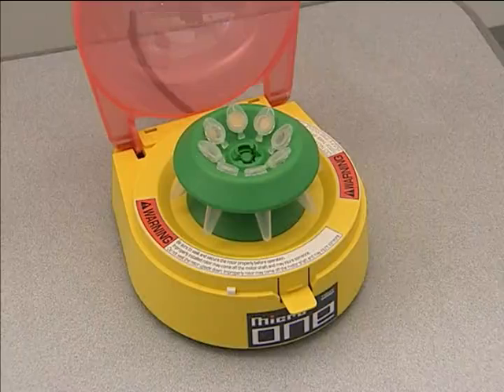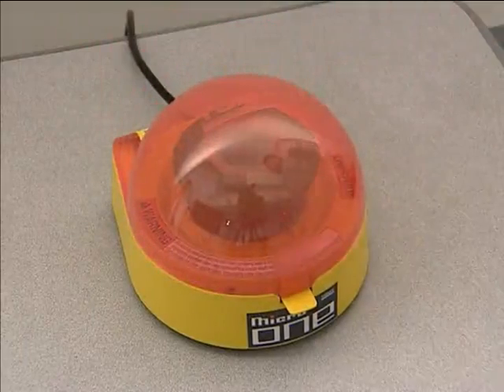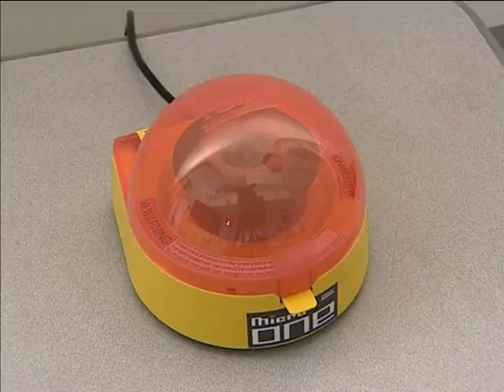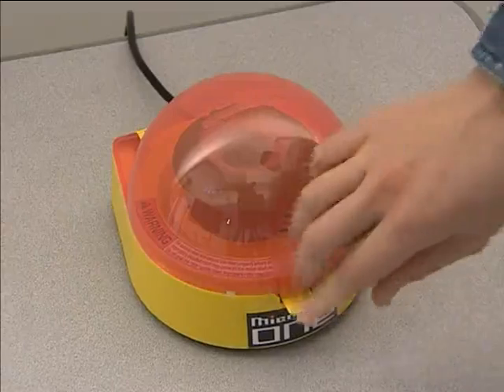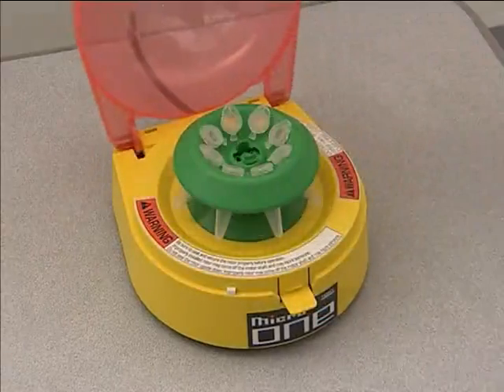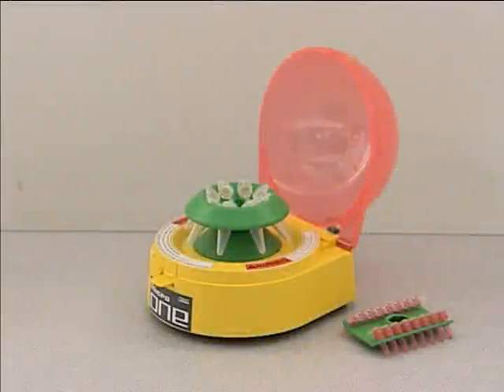You can change the micro tube rotor with the PCO8 strip tube rotor in the same way. The Micro One is very easy to use — just close the lid to begin a run. It is highly effective for a quick spin down of the sample. Press down the stop lever to open the lid; the rotor will stop automatically in a few seconds. The Micro One is ideal for quick spin and stop operation.